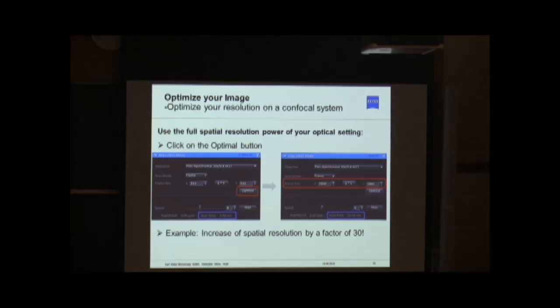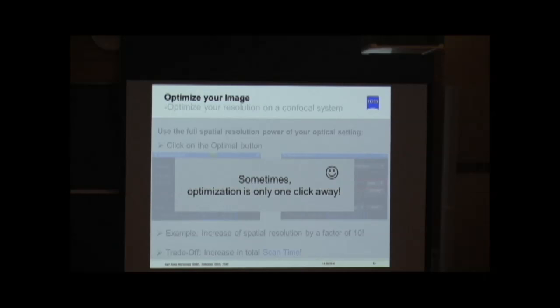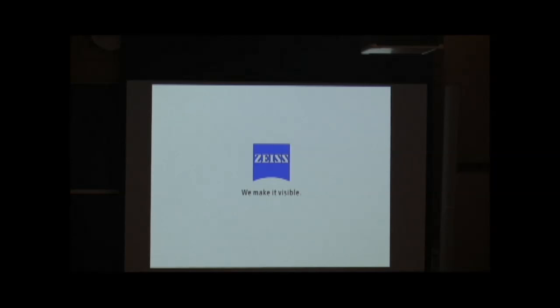However, the trade-off, of course, is the total scan time. Right? The total scan time is also increased by a factor of 30 because you scan a higher amount of pixels. But you increase your spatial resolution dramatically only by hitting that button. So the last take-home message that I would like to give you today is sometimes optimization is only one click away. And by that I would like to conclude and say thank you for your attention.